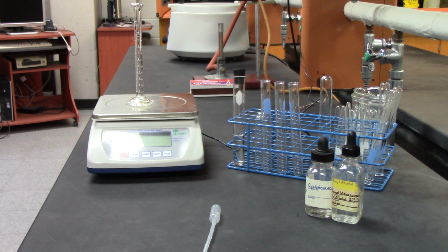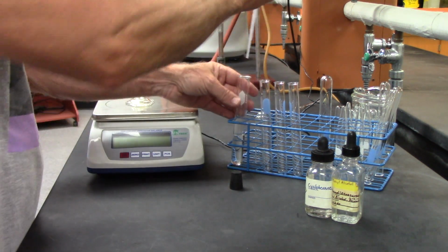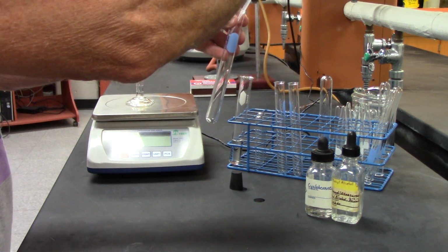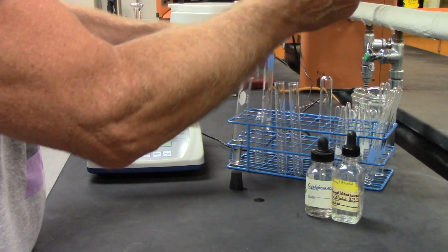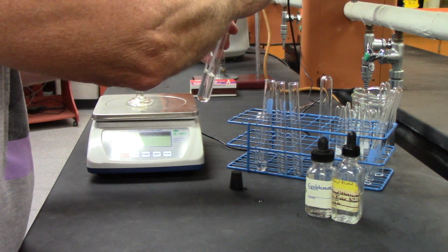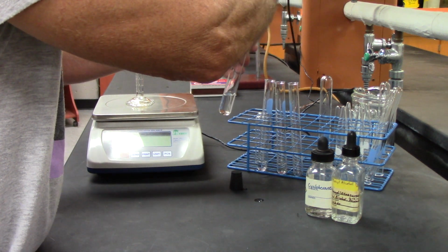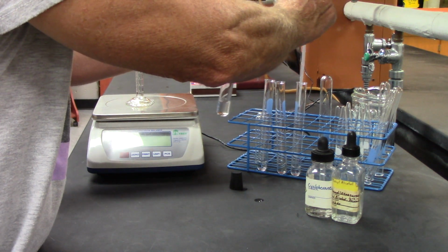Okay, so the first thing I'm going to do is put into each test tube, 1 test tube, my unknown, 2, 3.